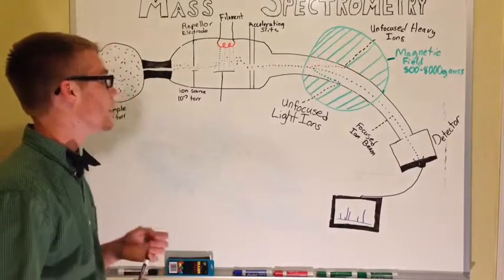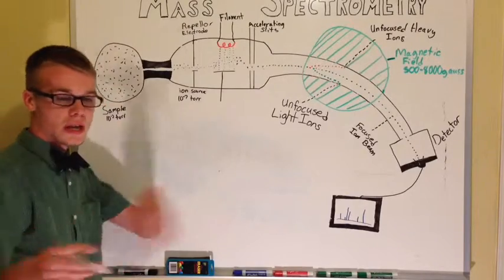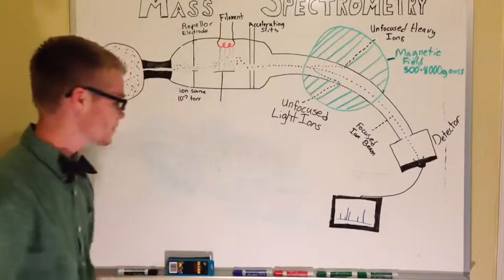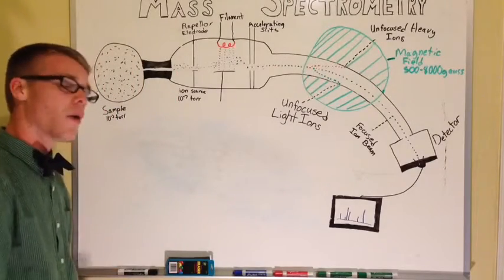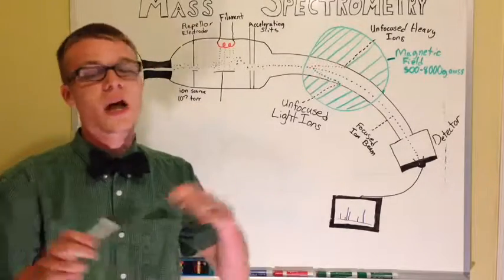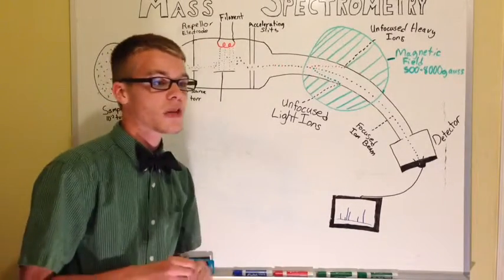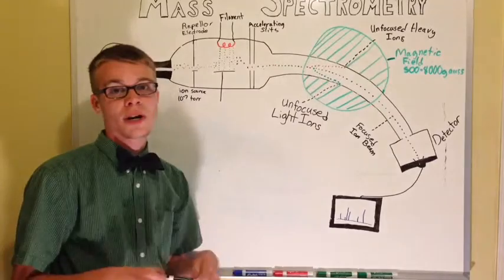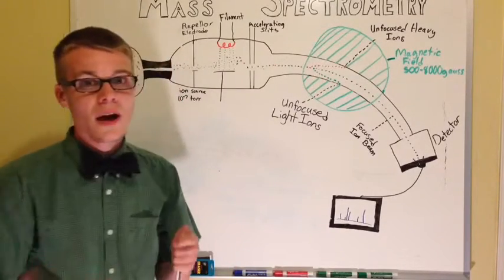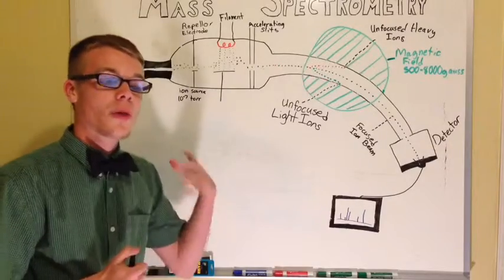They put it in this machine and it calculates this whole thing for them. It's really nice. And what do they use it for today? Well, they use it a lot in chemistry, forensic science, and a lot of other sciences as well. They use it, as I said, to separate the ions in a chemical. So it's very important.